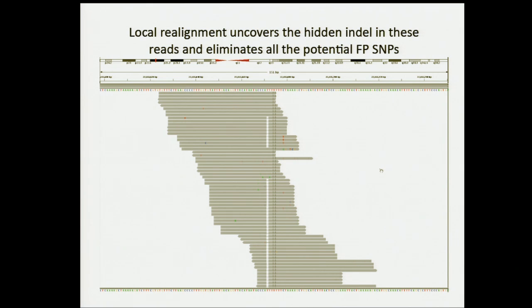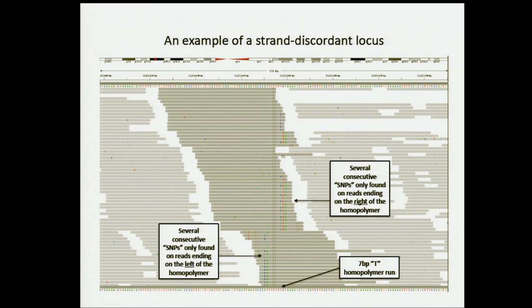And so it's very hard for an aligner, especially when the reads end right near the end of the deletion. When the reads end right near the deletion, it's very hard for them to decide whether there are two SNPs or one deletion. Generally, it's more expensive in their algorithm to insert or remove bases from a read than to make a mismatch or two. So until you have the whole picture and can see that there's a lot of weird variation going on, it's hard. We can't really fault the aligners there.